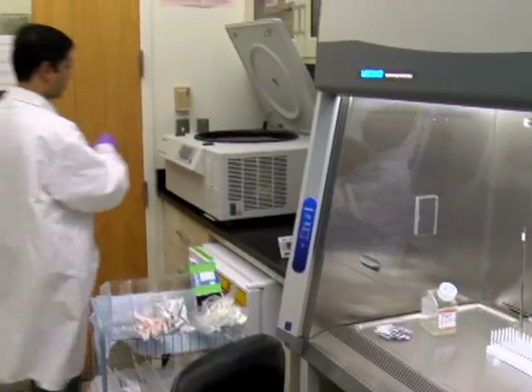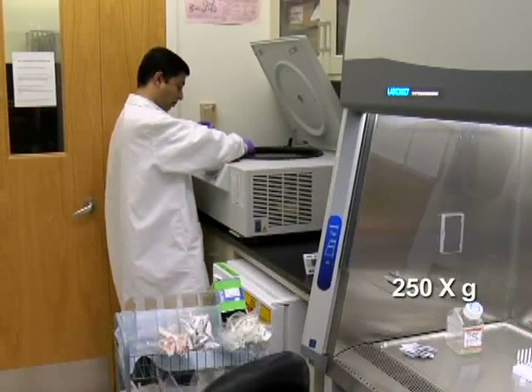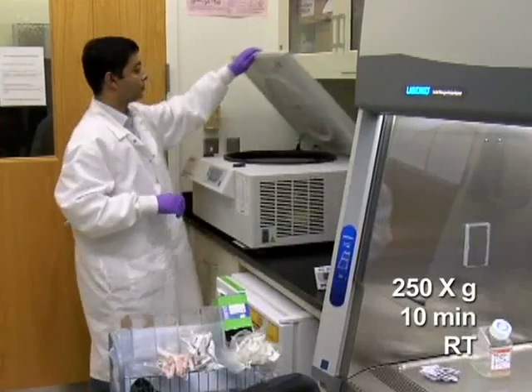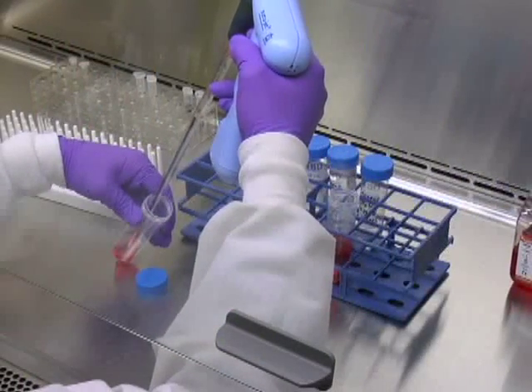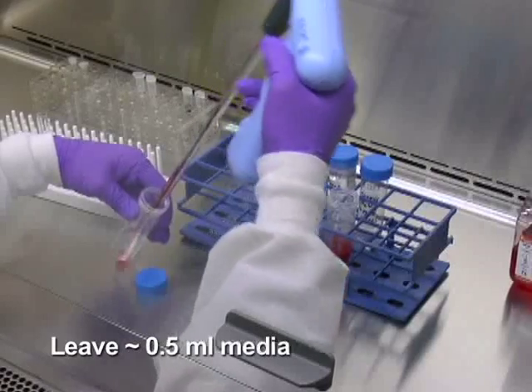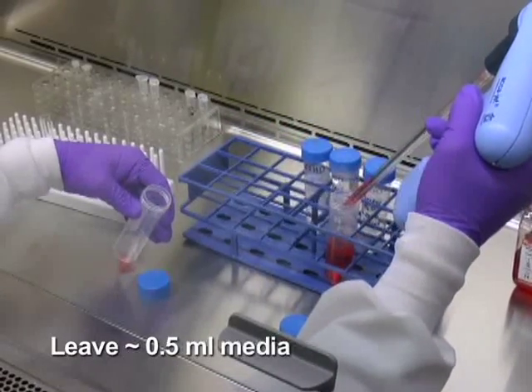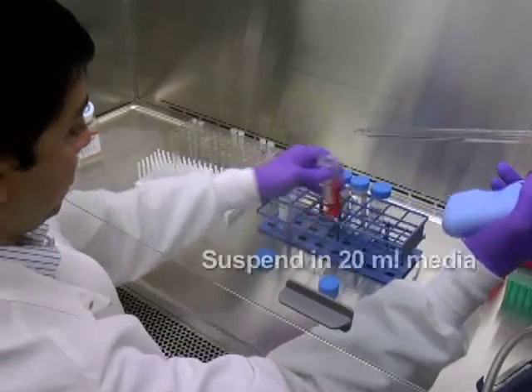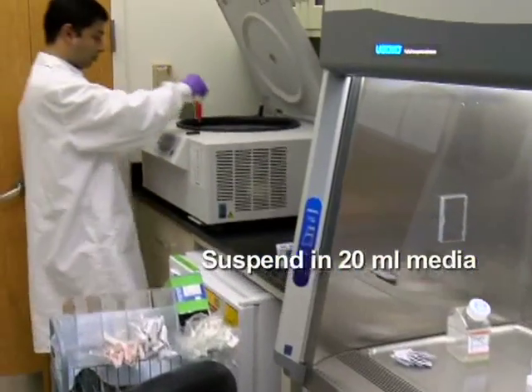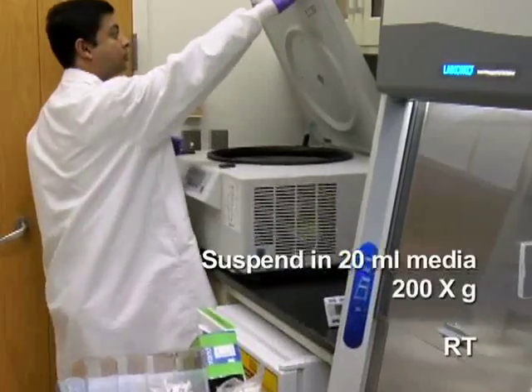To collect the cells, centrifuge at 250 G for 10 minutes at room temperature and remove the supernatant, leaving behind around 0.5 milliliter of media above the pellet. Proceed to wash the cells once by suspending the pellet in 20 milliliters of media and centrifuging at 200 G for 8 minutes at room temperature.